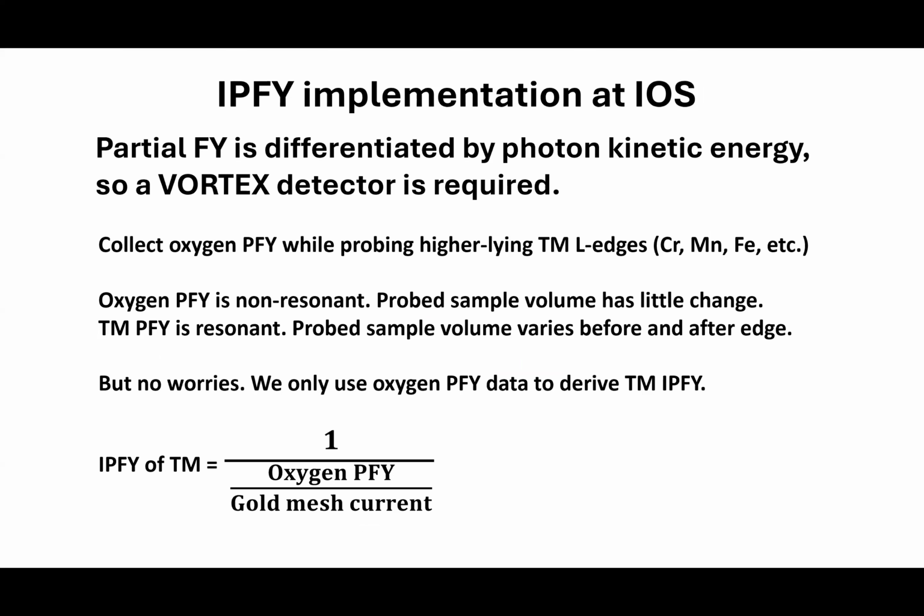And these are some practical considerations. Usually each time we get data from the beamline, Adrian gives us very detailed instructions on how to interpret the data, because we usually have several columns, and he gives a detailed explanation of which column to use and what they mean. But the idea is, we can understand what they are trying to do.